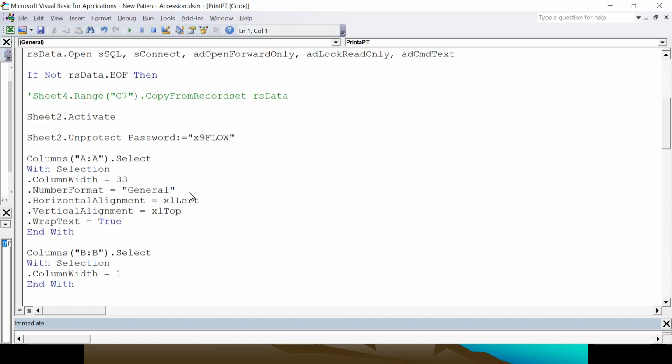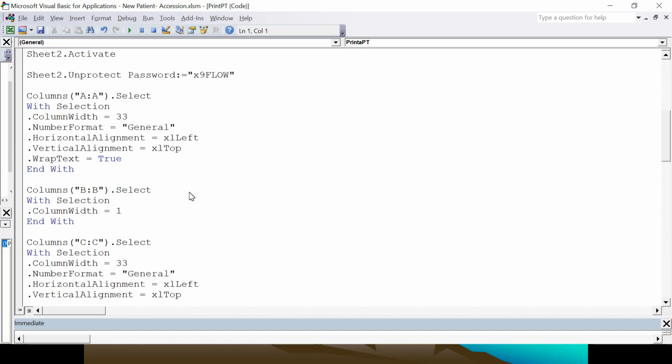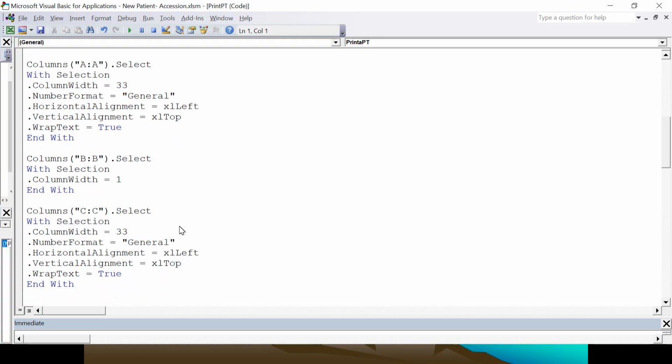After the search, it populates the Excel sheet. Also, this one has the protect format. At the beginning, I talked about protecting your design. In your VBA, you can also use this code to protect and unprotect your worksheet, so you can make a change with this one. That's the thing you can see.